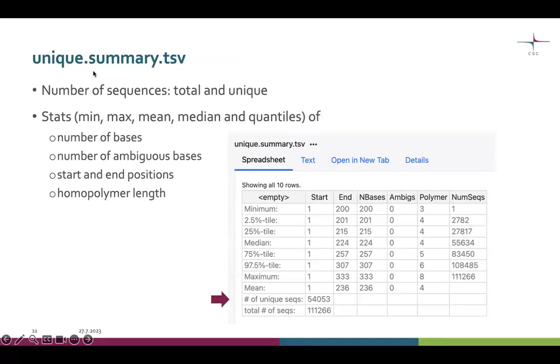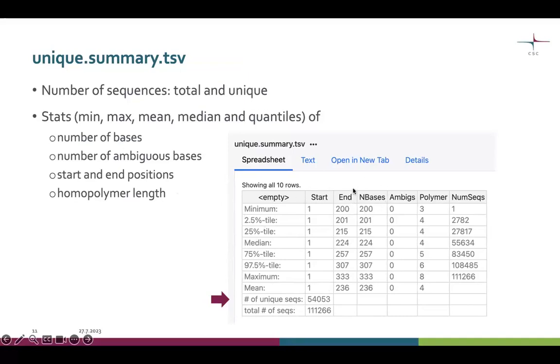As output we get a FASTA file with the unique sequences, a count table tracking how many represented sequences are in each sample, and a summary file for sequence information. This summary file — which always ends in summary.tsv in Chipster — is very useful throughout our analysis. It gives the number of total sequence reads, the number of unique sequence reads, and the minimum, median, maximum, and quantiles of several characteristics in our dataset, such as the length of sequence reads and the length of homopolymers.